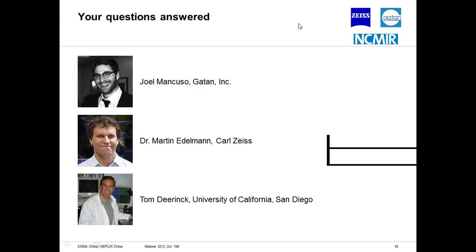Just to follow up on Tom's question, you know, Tom and Mark Ellisman, they were early adopters of this technology, and in the last year we've seen a huge increase of the number of systems that have been installed in the field. And I always tell people once they get their system that there are 2 areas that I think will be the most exciting, the next steps, the next improvements for this type of technology, because we've always borrowed from the TEM. Right, for this prep, even Tom's protocol of the heavy metal stain, it's an old high voltage TEM protocol. That's where the idea came from.